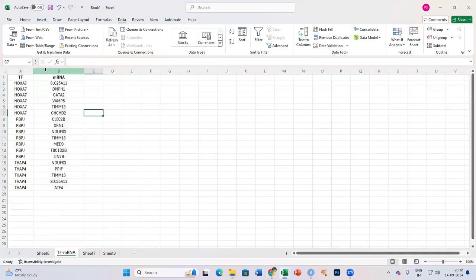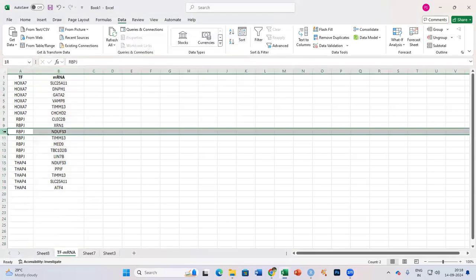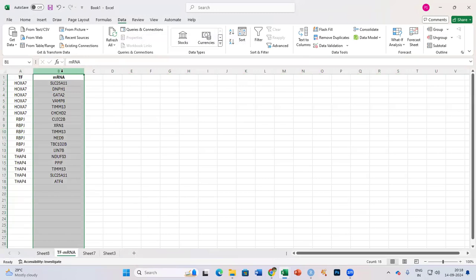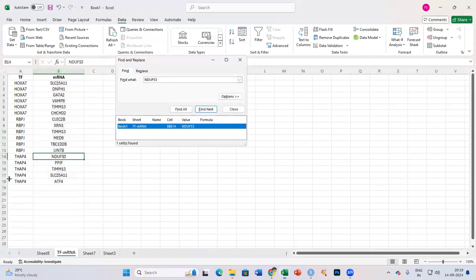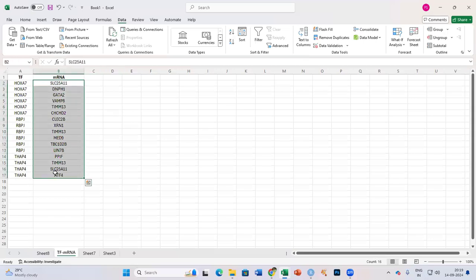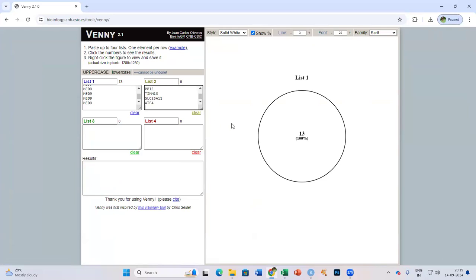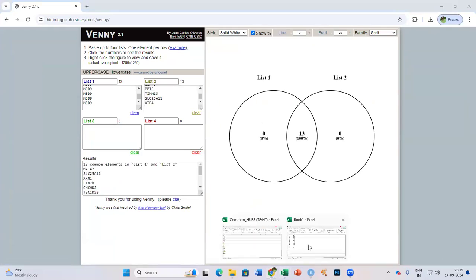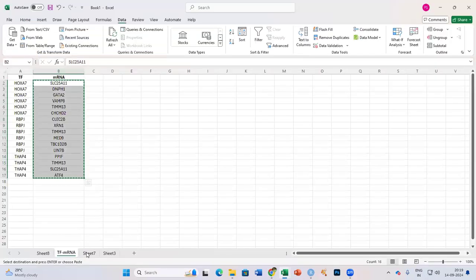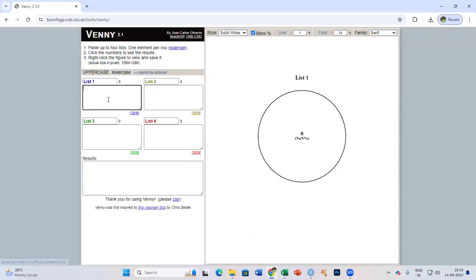We can delete it from here, right? There are two entries. This will make it equal. Right, so if we again check this by deleting this and re-entering, it is 13 now. So now let me again check for the TFs first. Genes is fine. We are now going for the TFs.